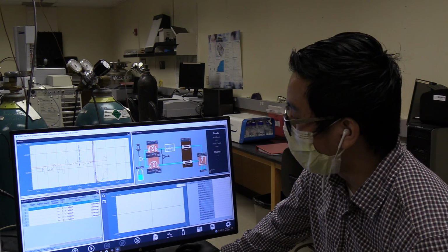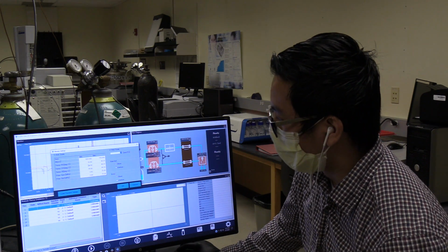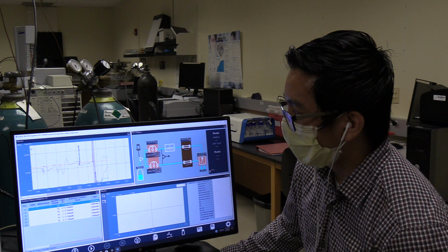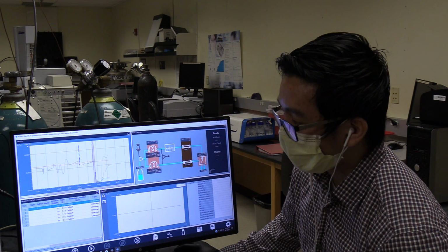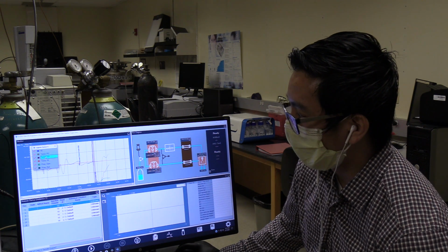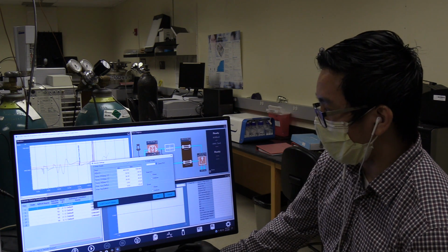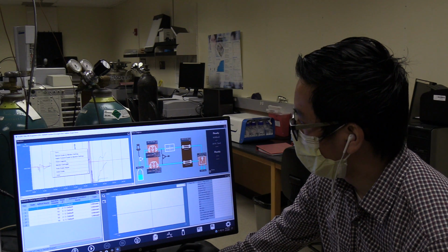If I wanted to adjust the scale for any of these signal traces, I can right click, go to monitor settings, and then I can adjust the scale for any of my signal traces that I want to look at. So you can adjust their X and Y axis. In the event that I want to change what the primary reference signal is, right now I'm looking at the signal for my pressure reference, I can right click, go to show legends, and then I can just click what signal I want to focus on. So let's focus on RI. So right now I'm focusing on the RI signal. I showed you that you can change your settings for your X and Y axis. And if I wanted to, actually I will turn these settings off.